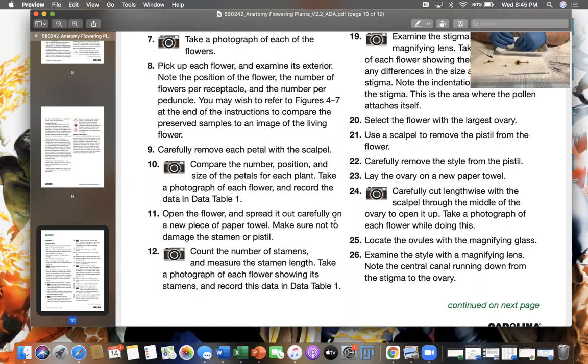It's kind of wrapped up in this petal, without damaging them, which is going to be challenging because there's a ton in here. All right, take advantage of your pins here, everyone, if you have to.